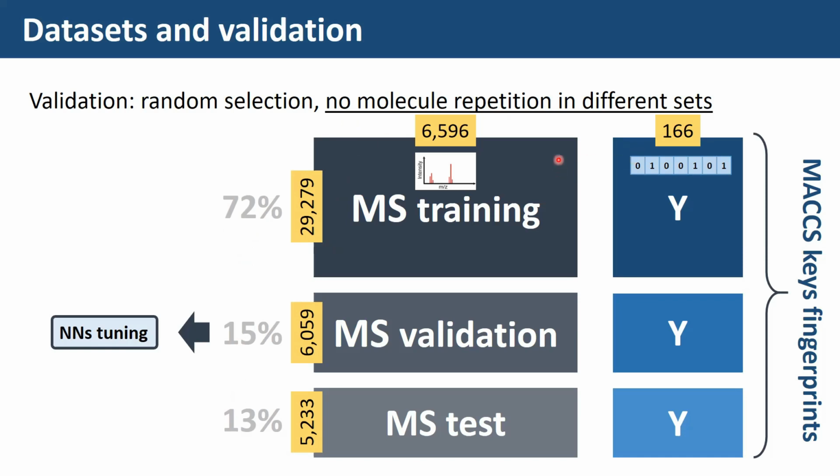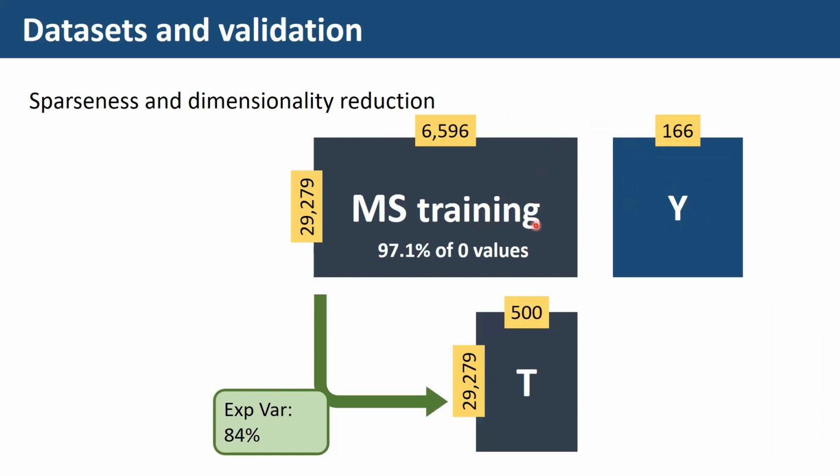And then we needed some chemometric models to get a relationship between the mass spectra and the fingerprints, in order to predict a new fingerprint given a new mass spectrum. So this was the final aim. In order to do that, but I will do that later, just one step before.